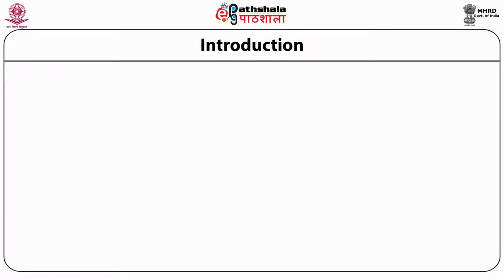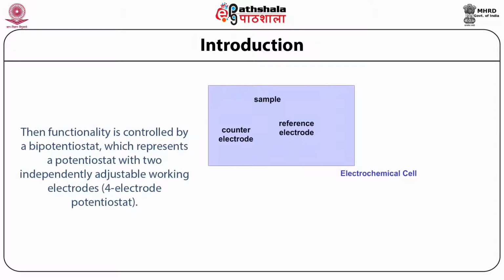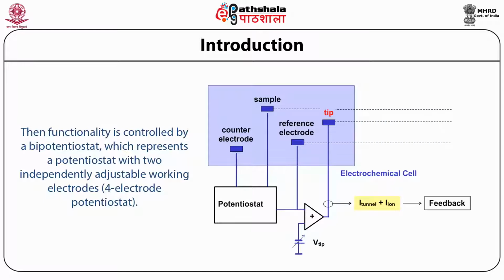We'll talk about the functionality of this technique. The functionality is controlled by a bipotentiostat, which represents a potentiostat with two independently adjustable working electrodes.